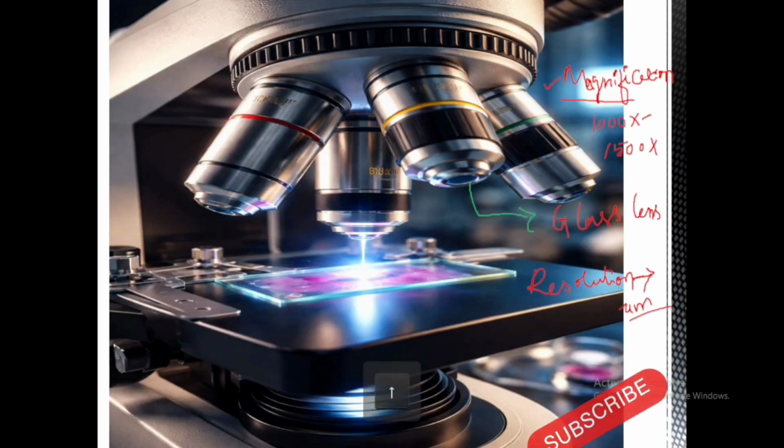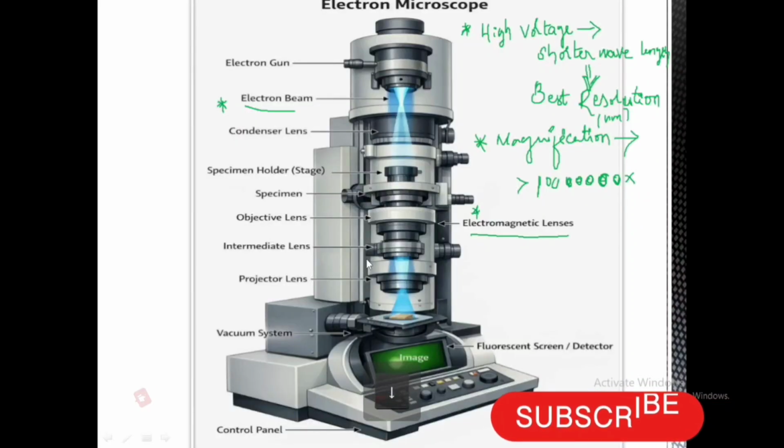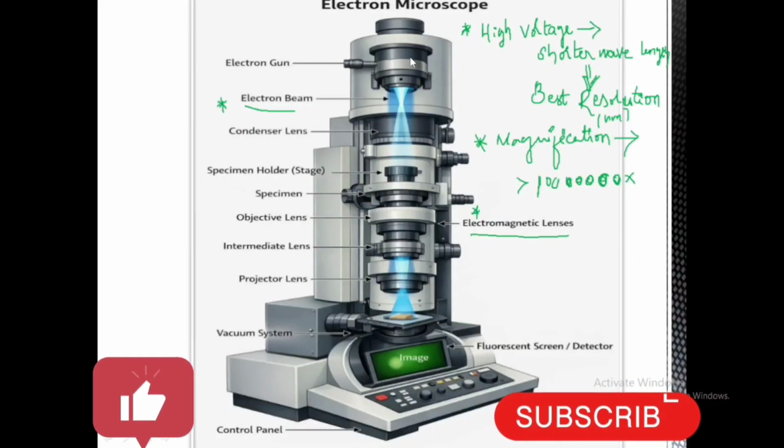The next is the medium of travel, how the rays travel. In the light microscope, the light rays travel to the specimen mostly through air. In the electron microscope, the electrons travel through a high vacuum. With the help of the vacuum, electrons can move from the electron source, that is the electron gun, then the beam of electrons passes through the condenser lens. After that it reaches the specimen.